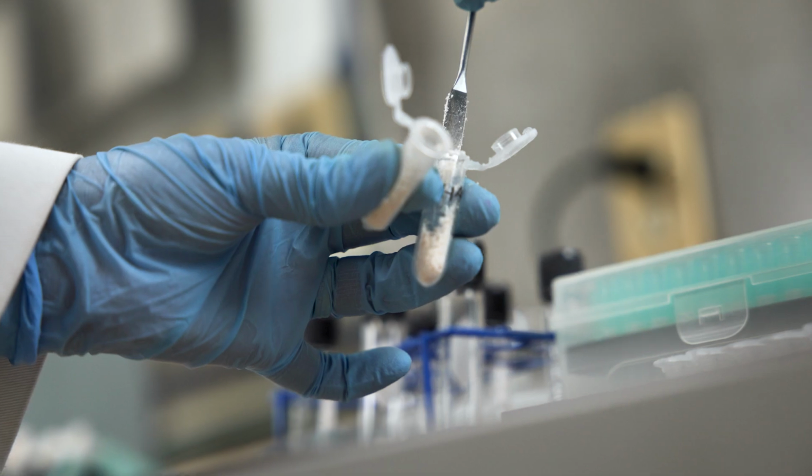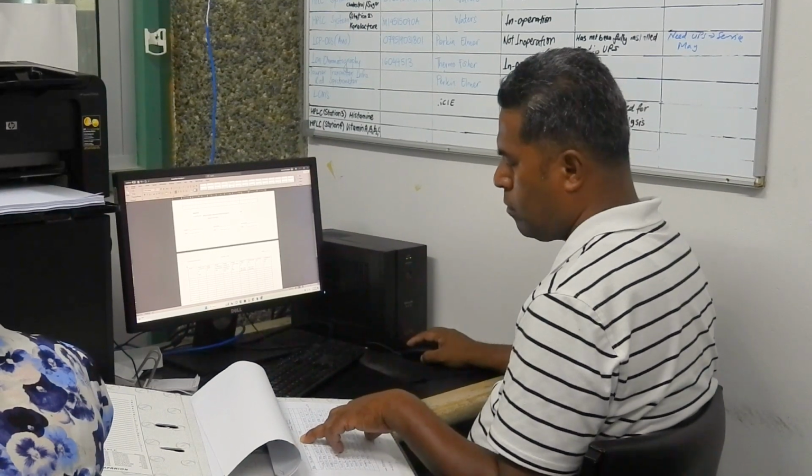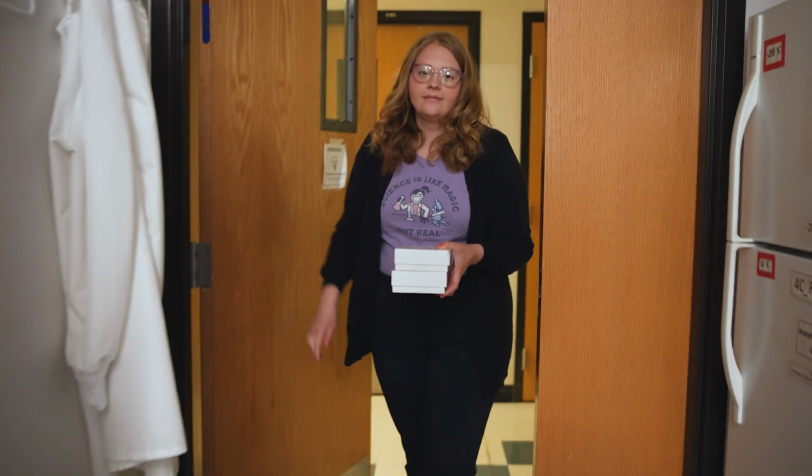You will also observe the PTFI lipidomics methods in action and learn about potential research applications of these analytical techniques. Let's begin.